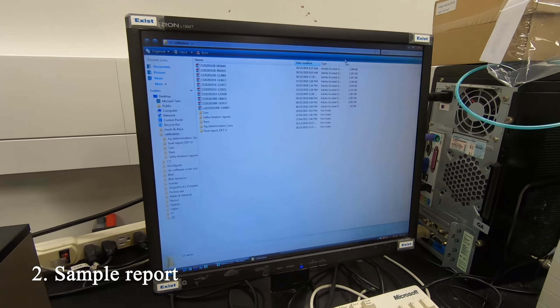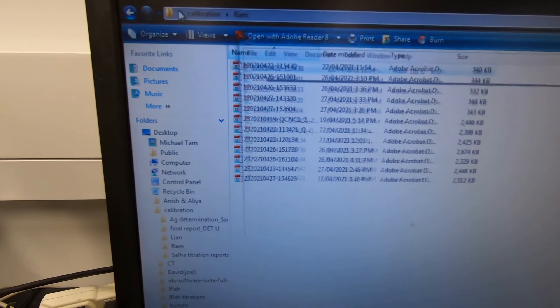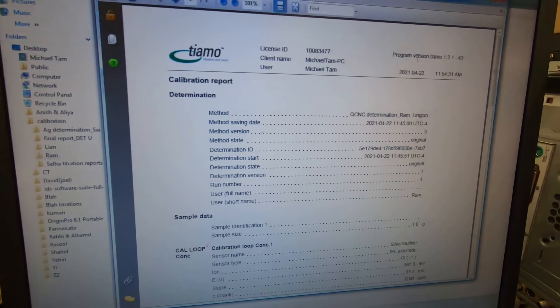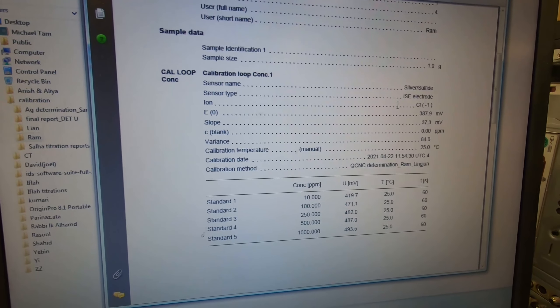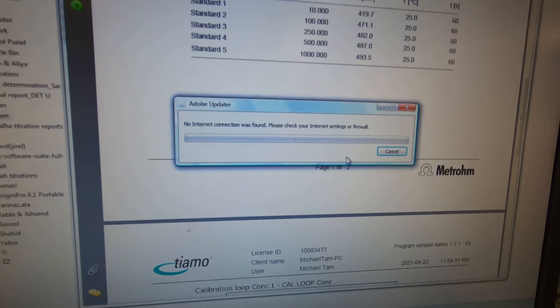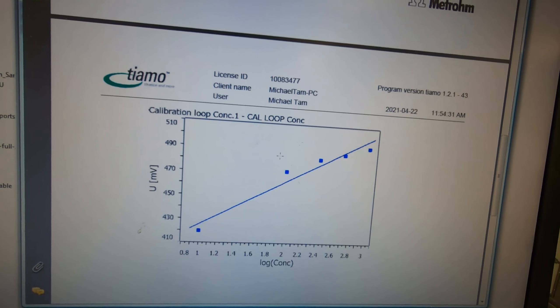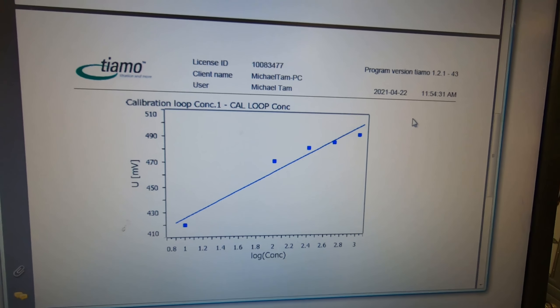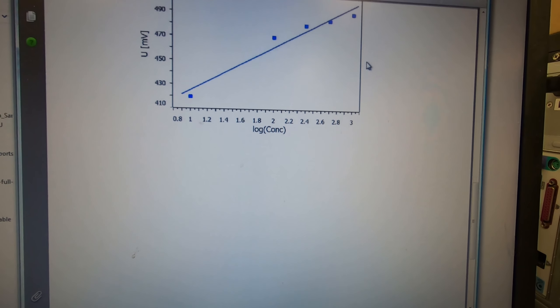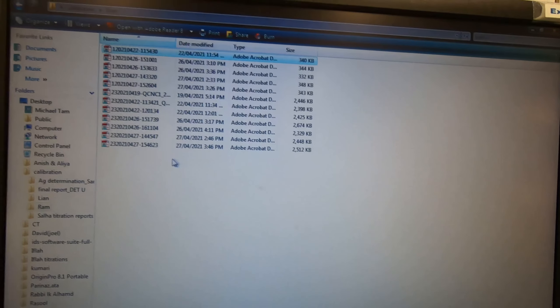These are the previous reports, for example. The calibration report - they all come together. This is the final result report. The calibration is also included - the calibration ranges. It will create a calibration plot as well. Although we don't always attain clear linearity, this is only the calibration, then the final report follows.